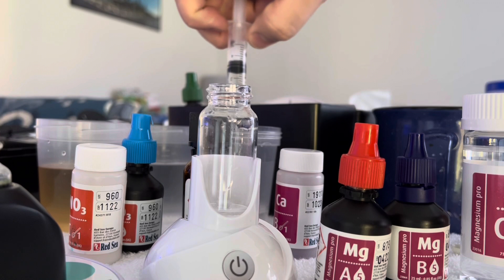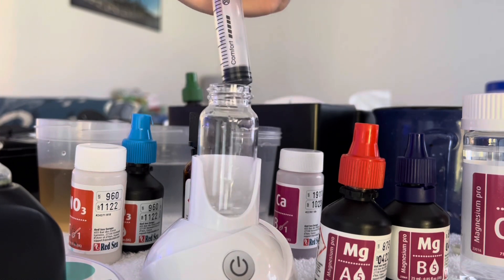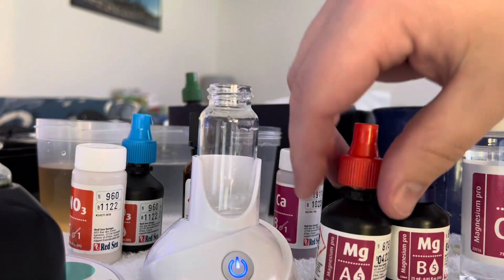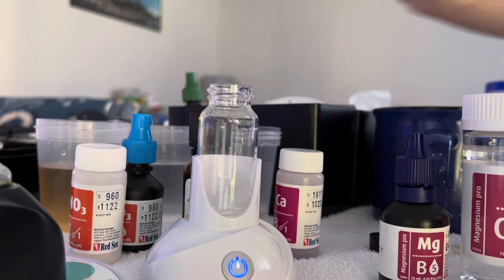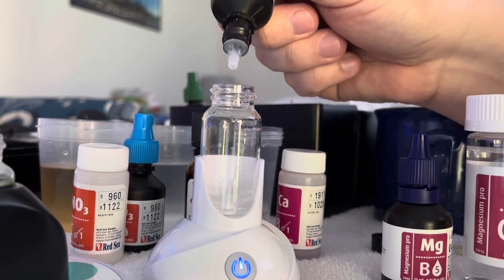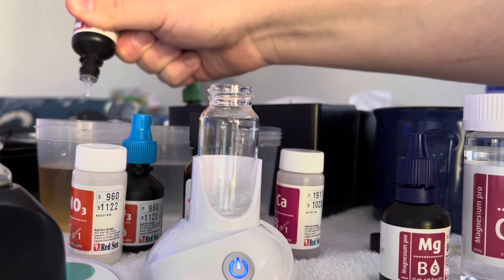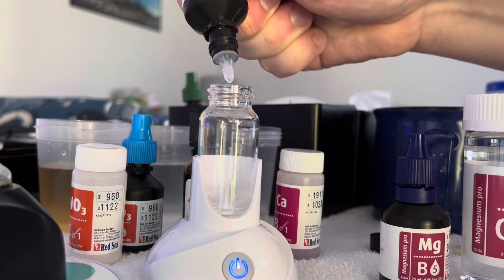Two milliliters, and it goes in. Turn on our stir reagent, give it a little shake. Now here's the fun part — I'm going to get my first drop, because this one's really hard to squeeze. First drop — I'm just going to throw away one.